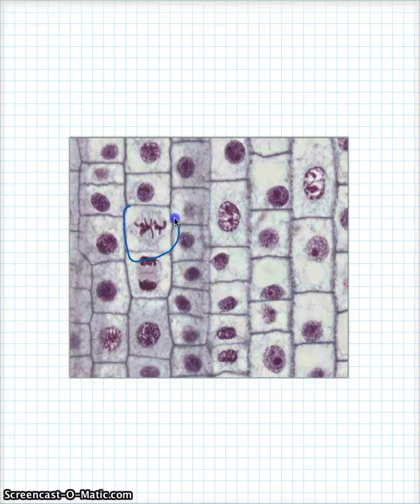This guy is in metaphase. You can tell because those chromosomes are lined up right in the middle. I'm going to erase what I just did there because I'll talk about the cell next door. This cell next door. This is late anaphase, maybe early telophase. How do I know it's in early telophase? I can see the cell plate forming right in the middle. That's a new cell wall that's starting to form. So, I'd probably call that one telophase.